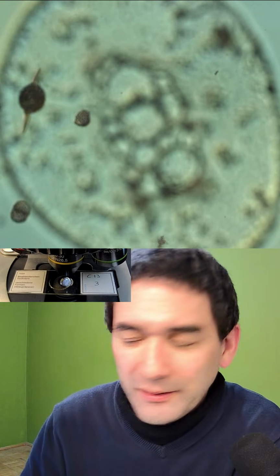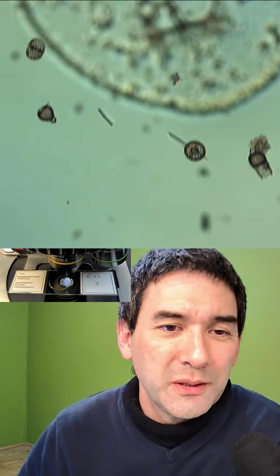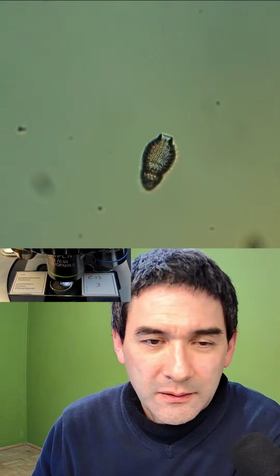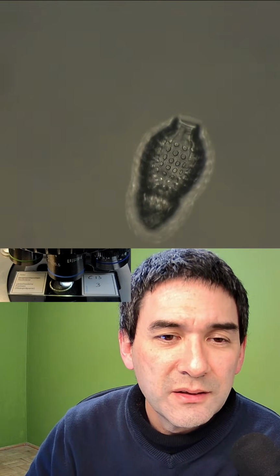No, that's not the one. Yeah, here we go. This is some kind of dirt or whatever. Here, this is how they look. And I'm going to go up now. Here we go, in bright field first. Okay, let's go up again. So these are the so-called radiolarians.